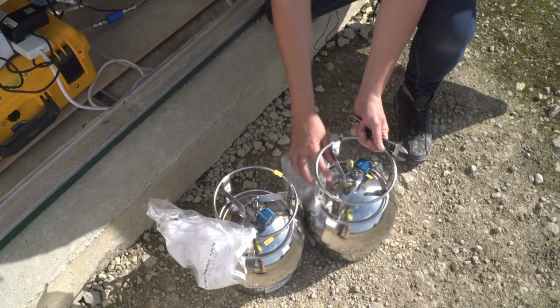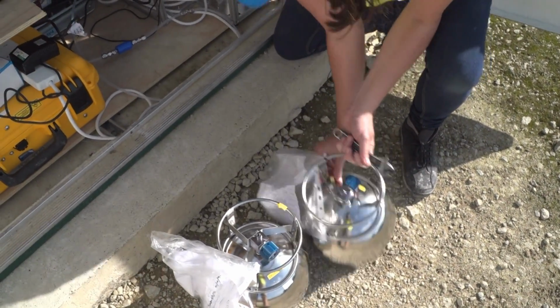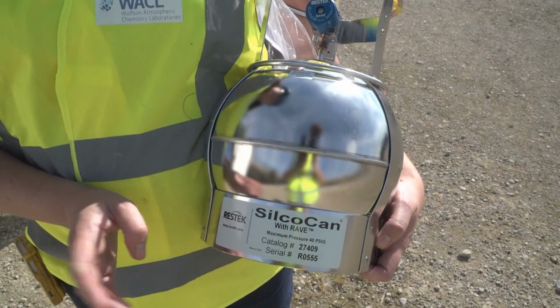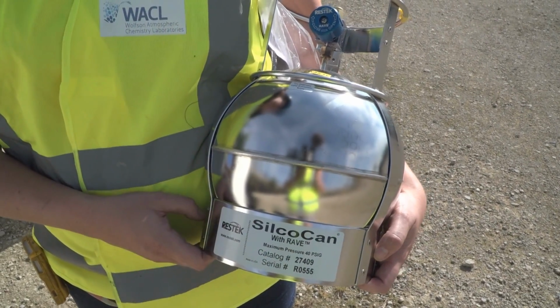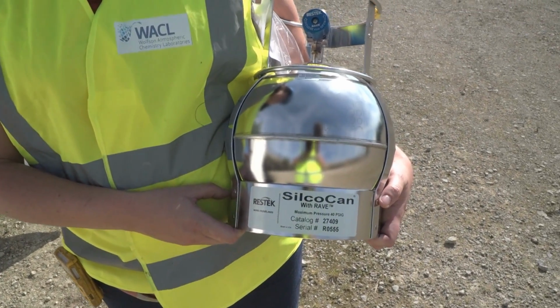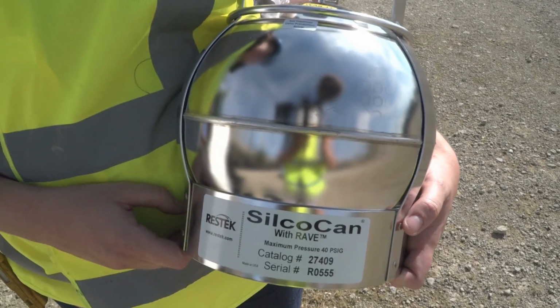I'm Ruth Purvis and I'm a research fellow in atmospheric chemistry at the University of York, working with the National Centre for Atmospheric Science. So what we've got in here is a sample of air that was taken at 9:30 on Monday morning for a period of an hour. But what's interesting about it is we do this every Monday. So since January, every Monday morning, we've had a sample of air from this site.